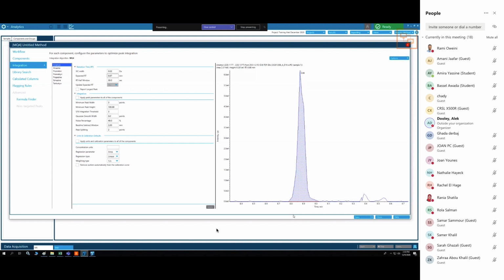We do have a few more data points. The peak is a little bit narrow. All right, so that is 0.1. So the peaks are wider, so they're about 0.2. So that is good. Get more data points. Oh, yes, I want to apply. Okay, so atrazine will do the same thing, 0.2, apply. Then the next compound, 0.2, apply. Terbutryn, aha.